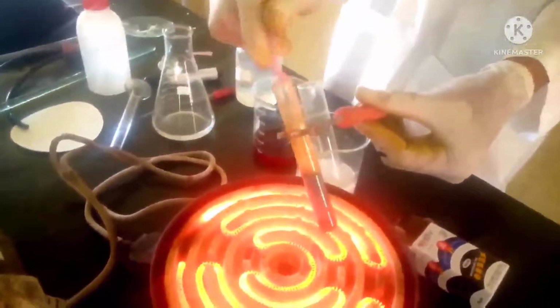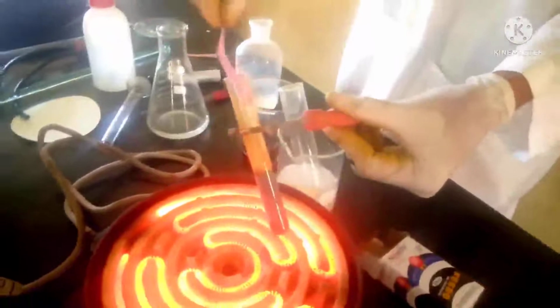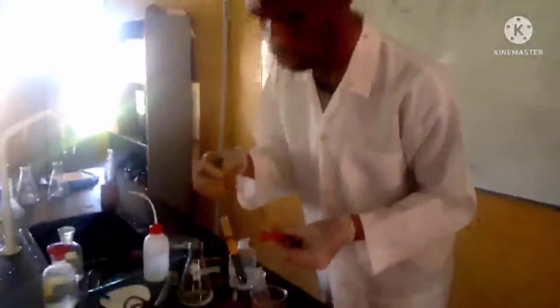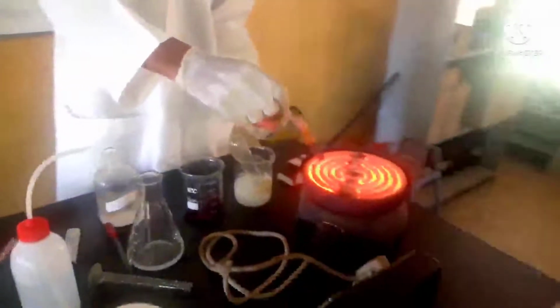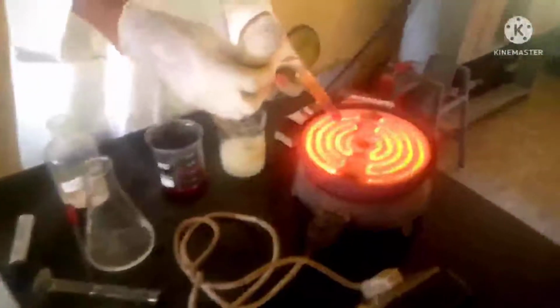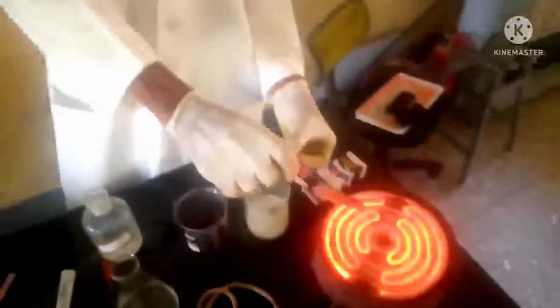You will see the moist red litmus paper turns blue. Yes, the gas is coming out now. The gas has some pungent smell. You see the way I'm perceiving it, and I didn't put my nose inside it. So the red litmus paper turns blue. It is taking some time, but it's already turning blue. If you put it, it will still turn blue some more. Now the gas is coming out much, so it turns blue.